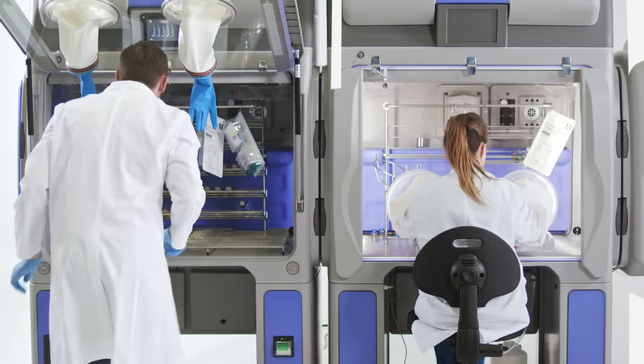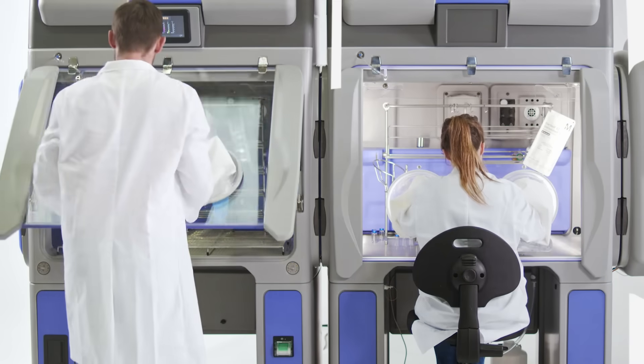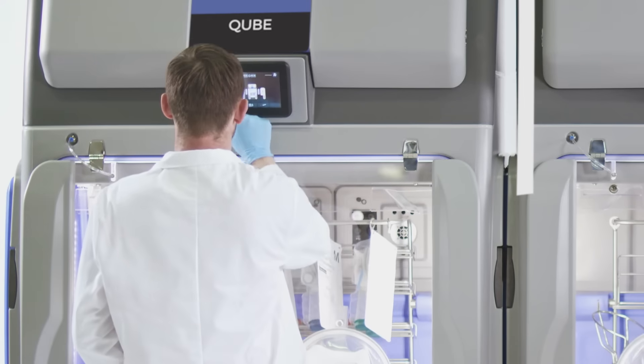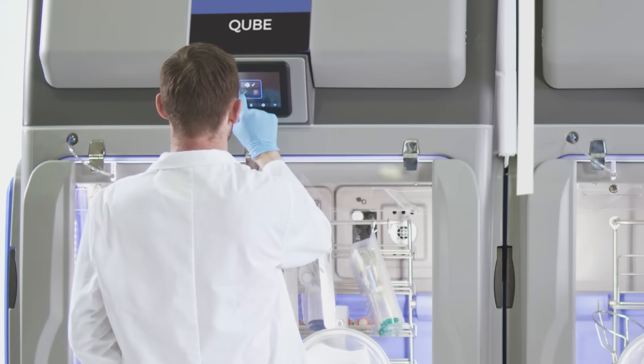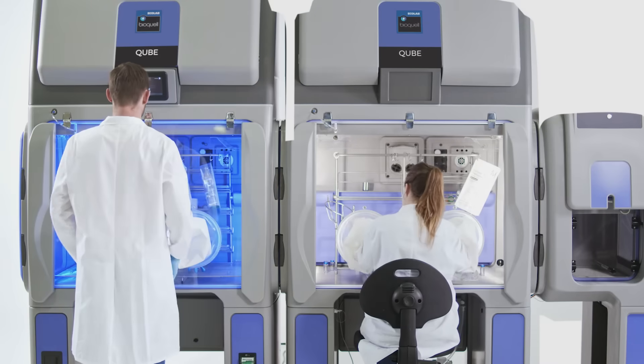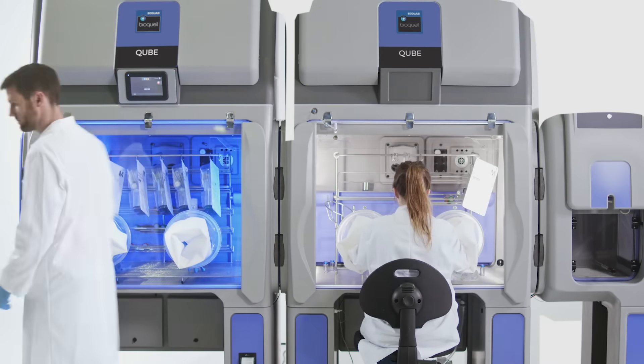Place your testing supplies on the racking in the vaporizer's chamber. When a cycle is started in the chamber with the supplies, exposed surfaces receive a validated six-log sporocidal kill in as little as 20 minutes.